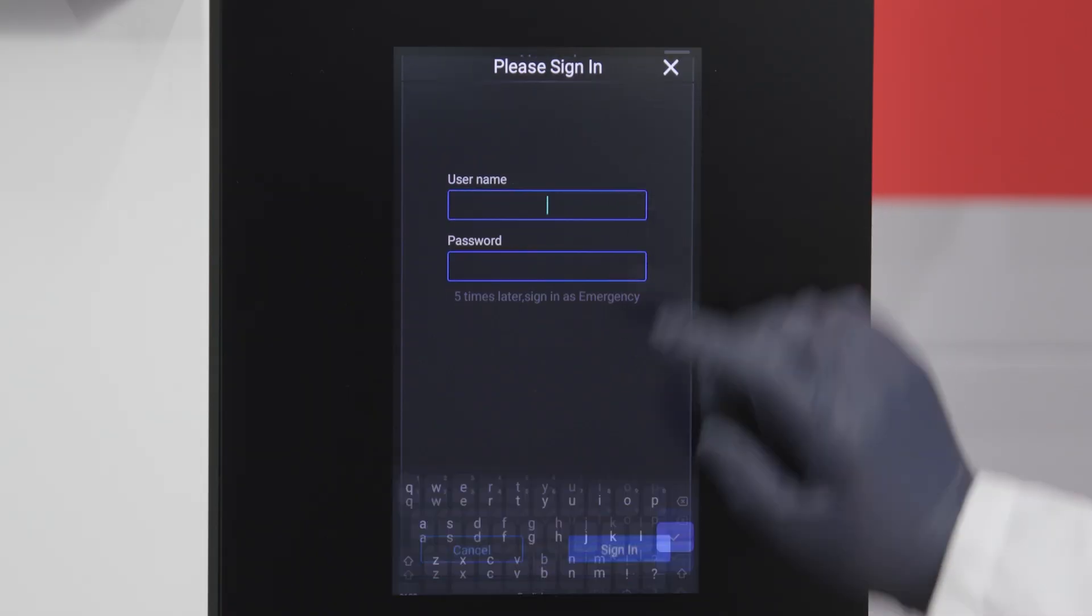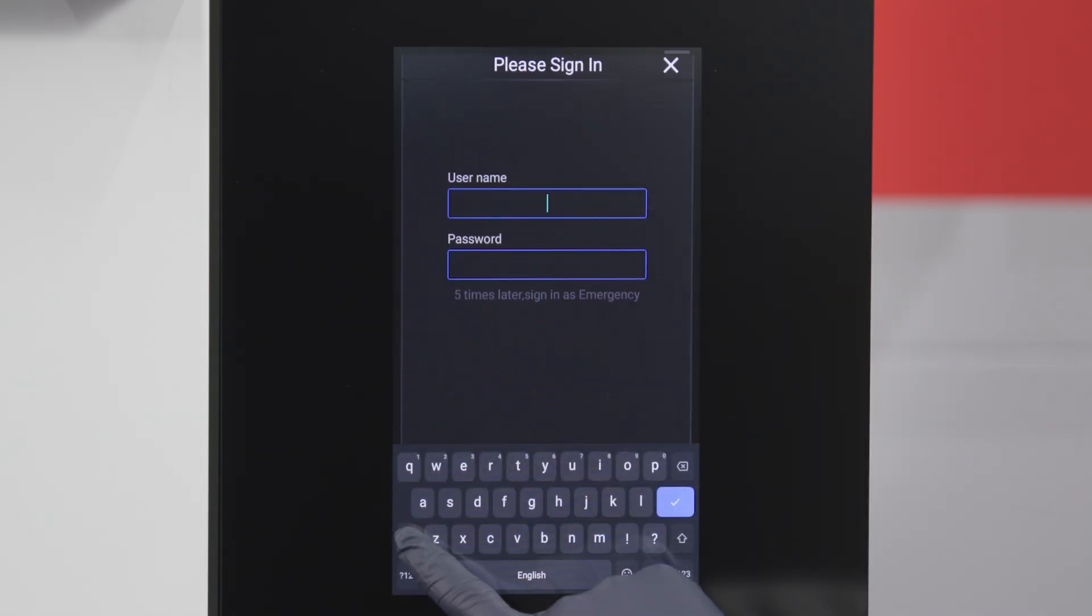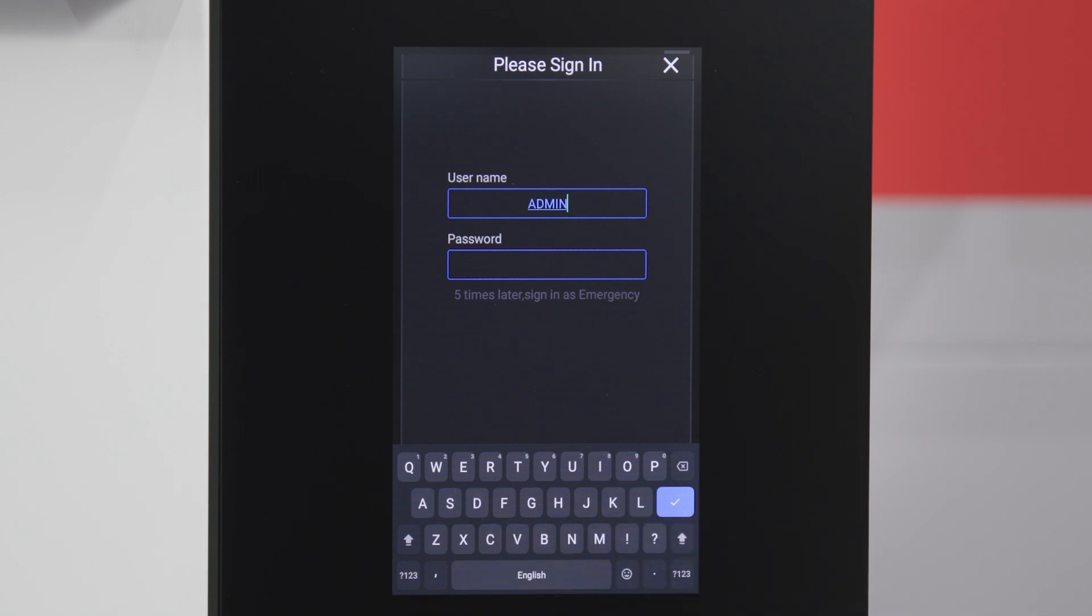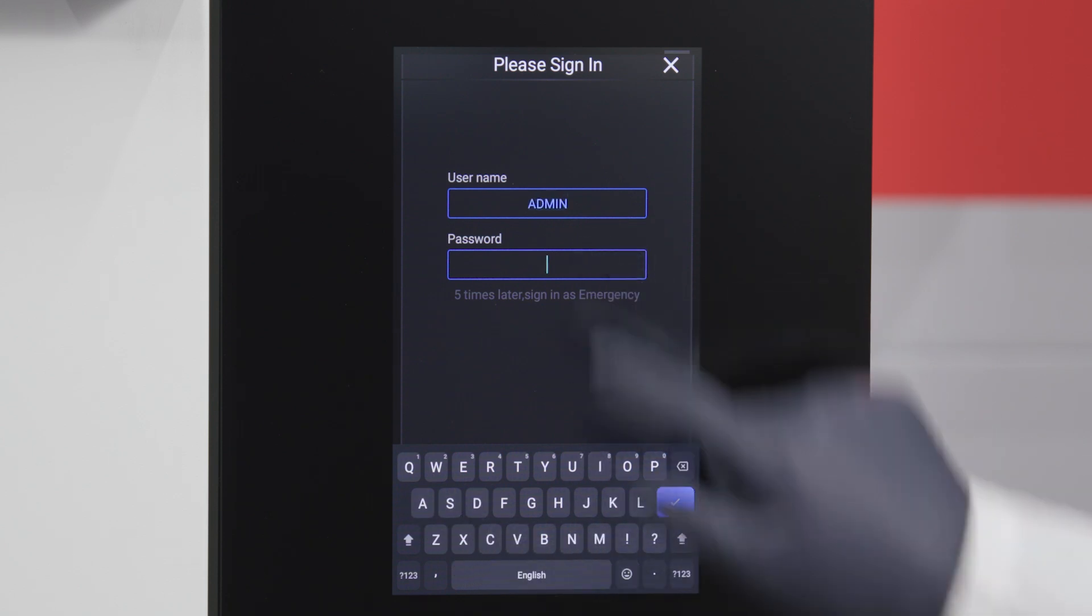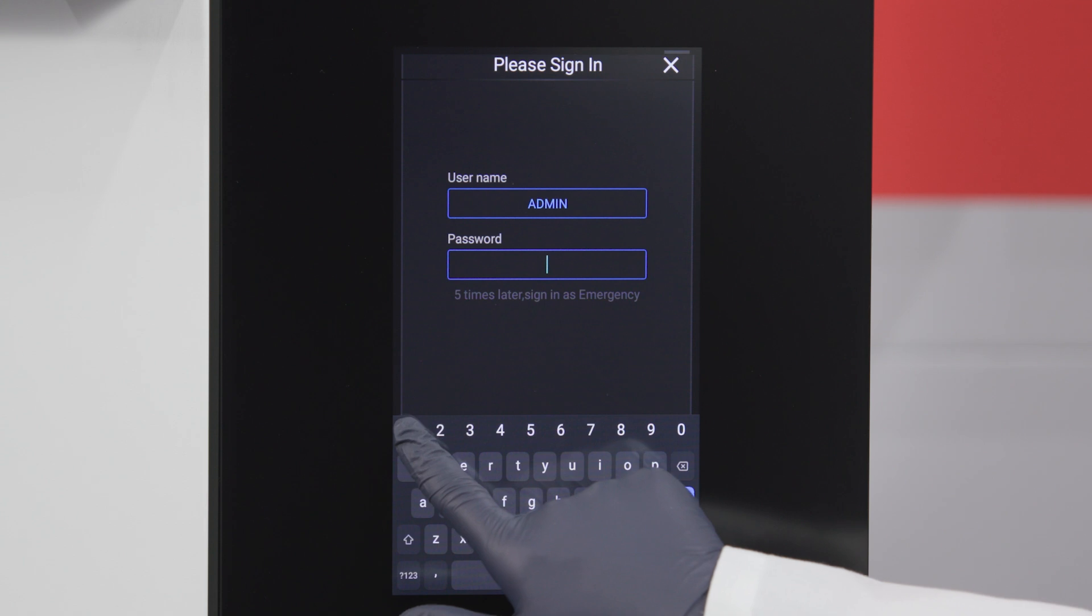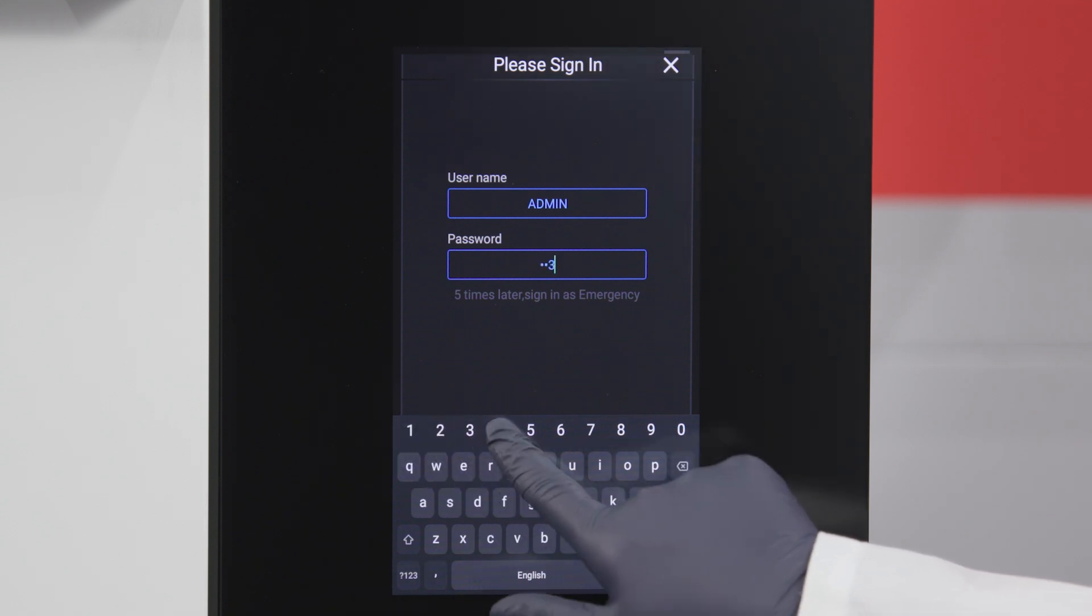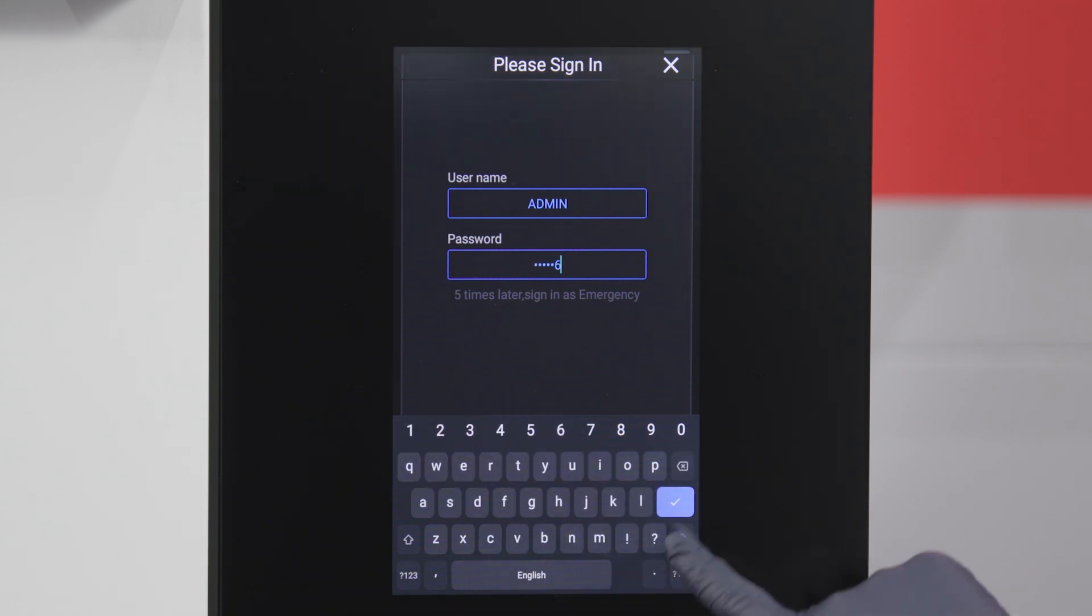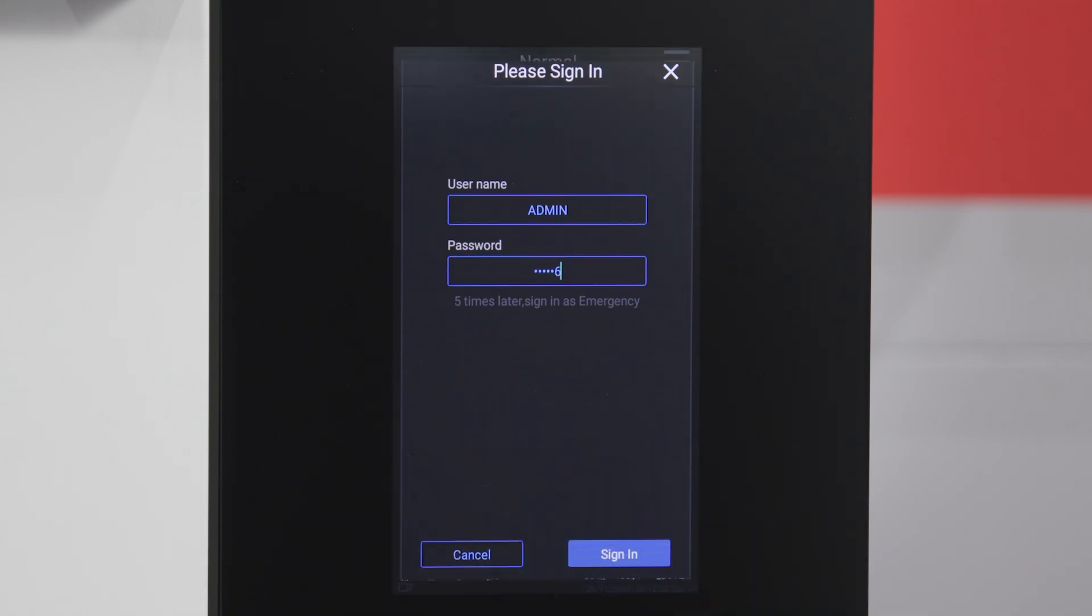A quick note before we begin: to operate the interface you'll need to sign in. The initial username is admin and the password is 123456. You can tap anywhere on the screen to sign in.